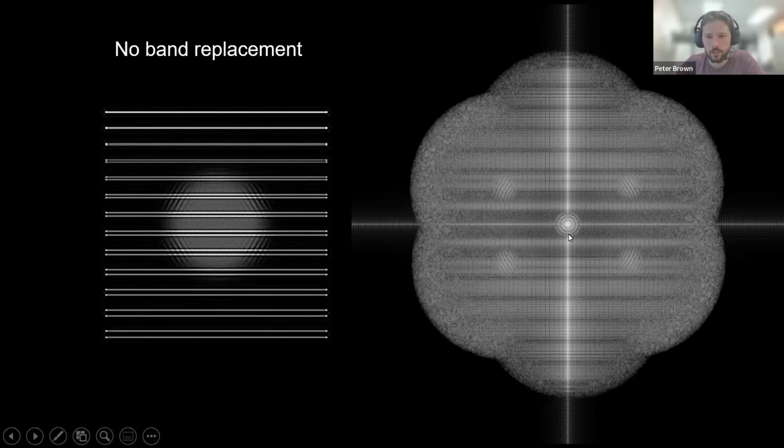So in particular, at DC, some of these concentric rings are coming from the disk pattern. And then at the SIM pattern frequencies, where the shifted bands have taken the erroneously mixed information from DC and shifted it, we again have strong artifacts here.